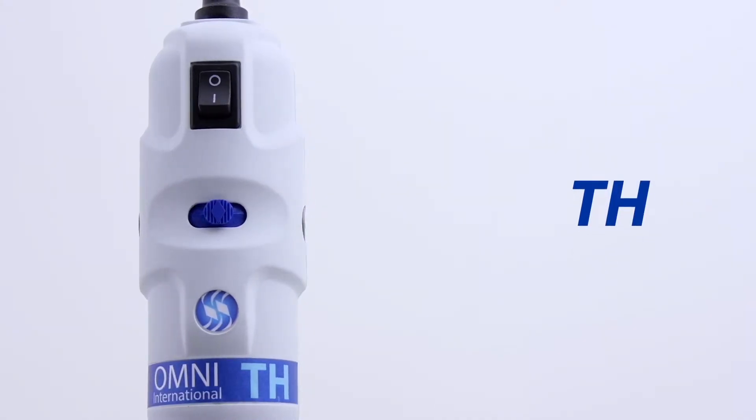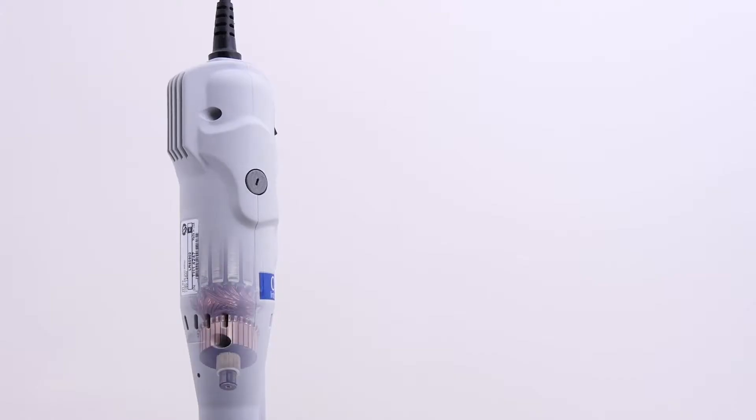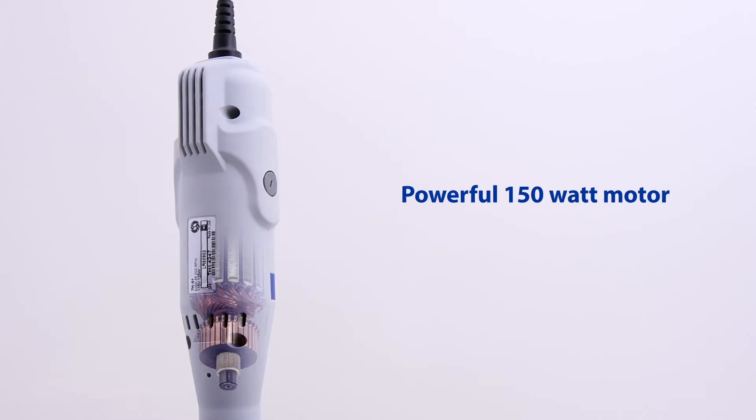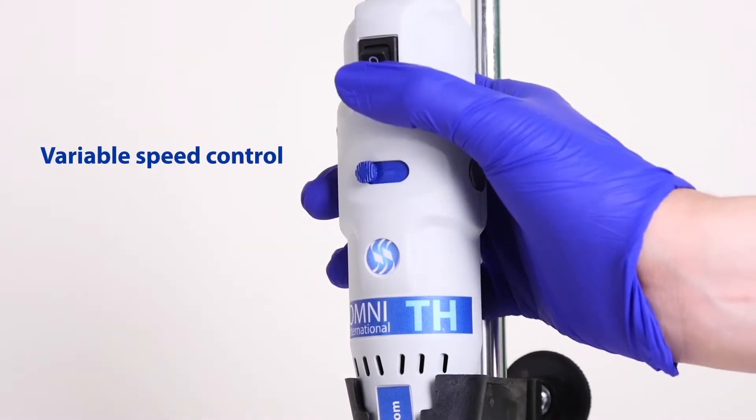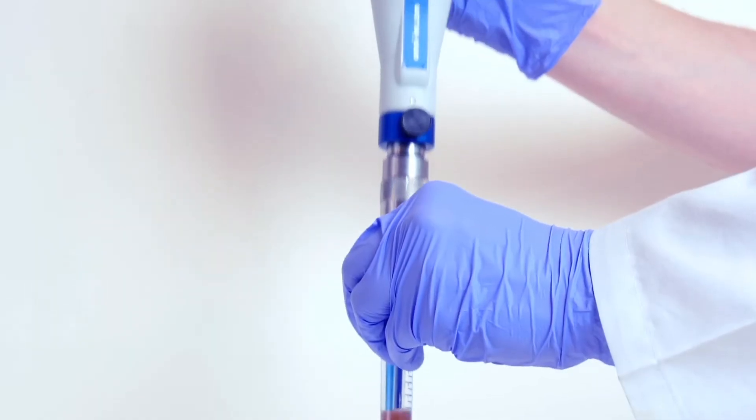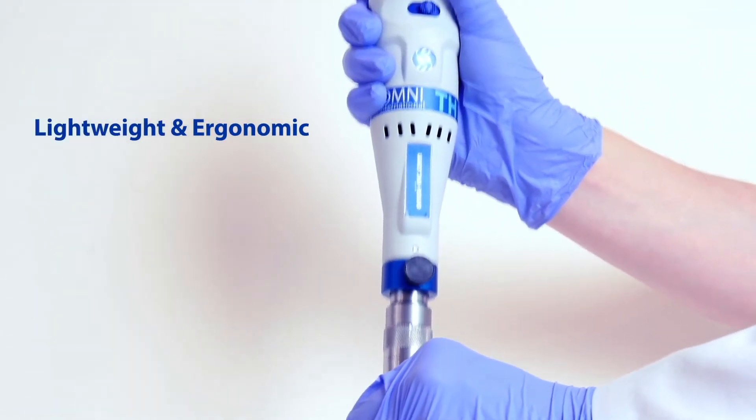The Omni TH tissue homogenizer is ideal for small-scale analytical laboratories. The TH features a powerful, compact 150-watt motor with variable speed control and separate on-off switch. The lightweight and ergonomic design make the TH a perfect fit for handheld operation.